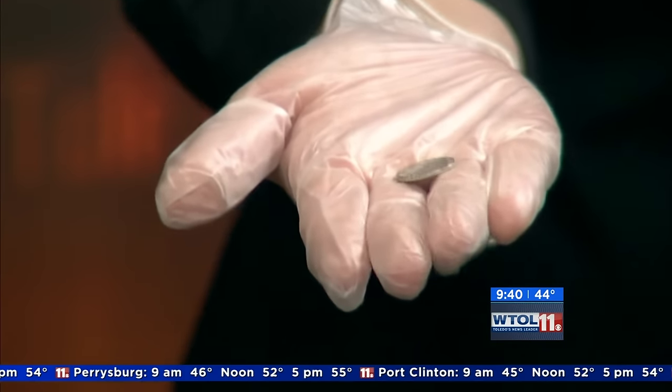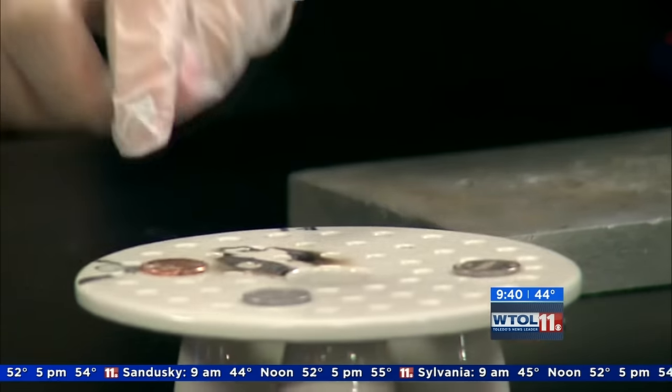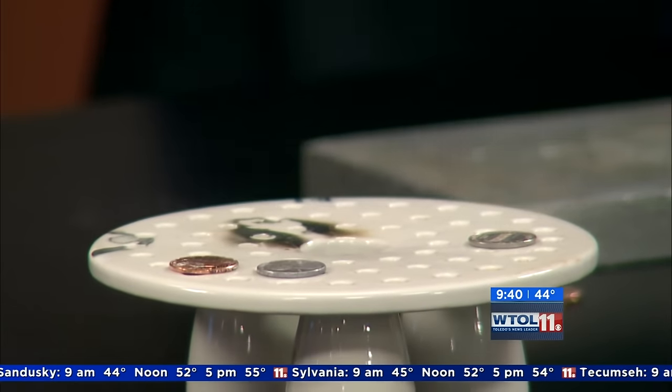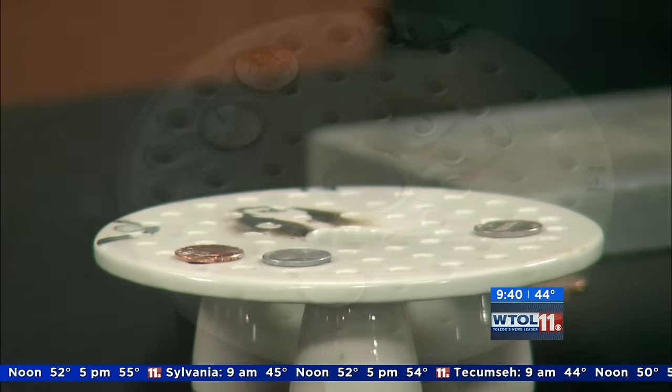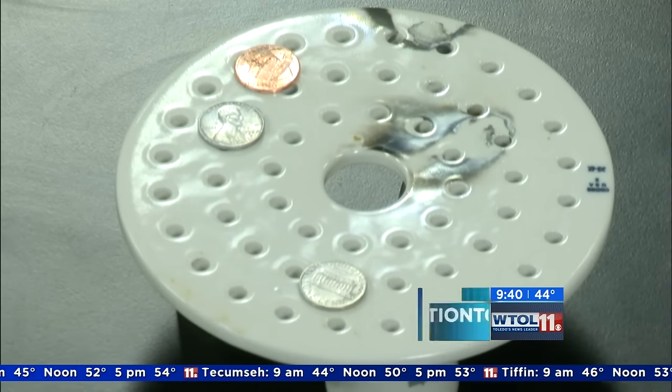It looks more like a dime or a nickel. So we have our zinc pennies and you can see they actually look much different than our copper pennies. But we can change them one more time, which is pretty cool.